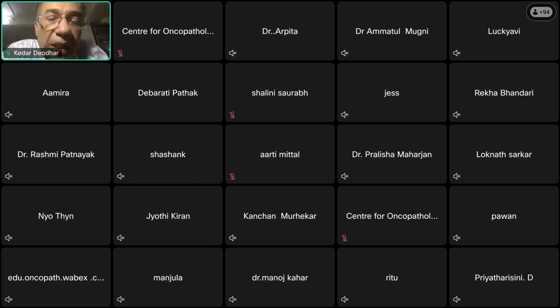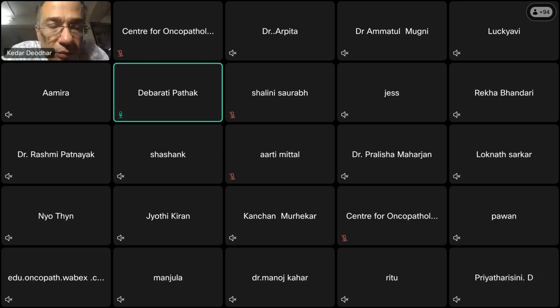So the posterior part is retroperitoneal. Yes. Okay, sir. How to avoid reporting false negative margins in frozen section in cases of poorly cohesive carcinoma of stomach, as sometimes identifying signet ring cells is very difficult on frozen?